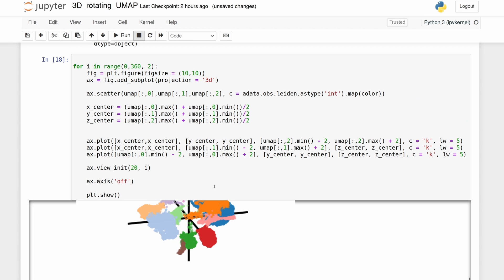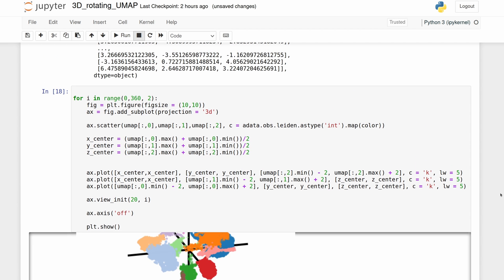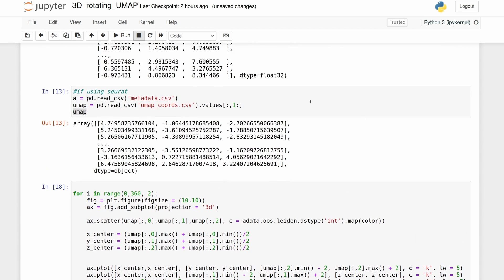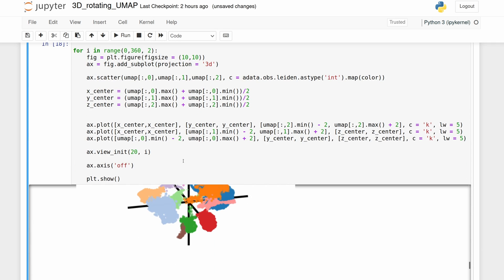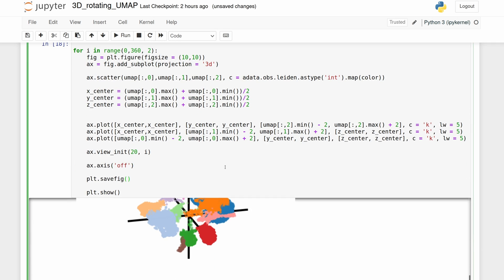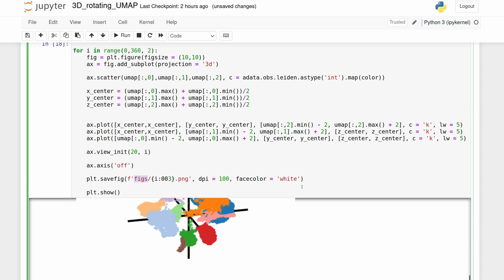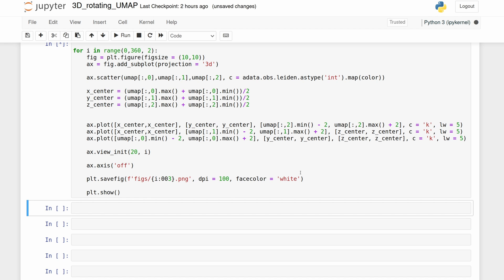So what we're going to do is save each image to a directory. So let's just make that directory right now. And then we're going to use the plot save function. So we're just saving every figure as a number based on the angle it's at into the figs directory.